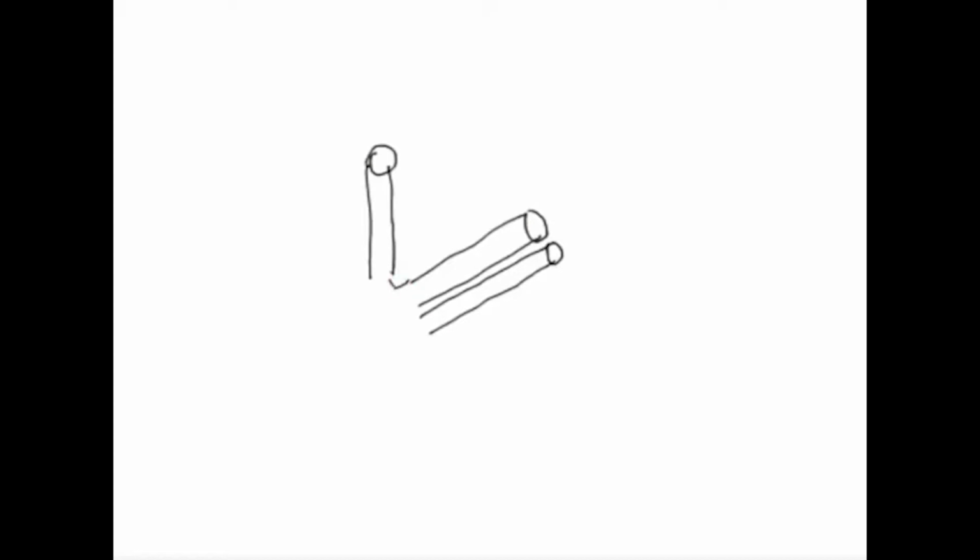If it is a binocular or a trinocular port, then you will have tilted eyepieces, or in some cases the mechanical tube also might be tilted. So you have tilted binocular eyepieces, and you will have another port for a trinocular port, and you can see that very easily here.